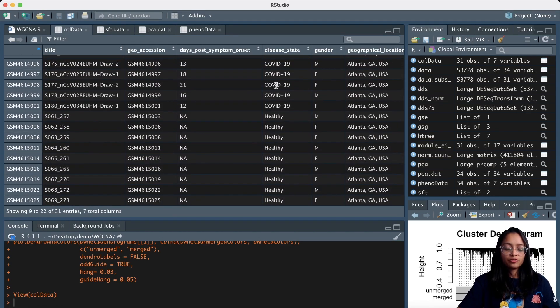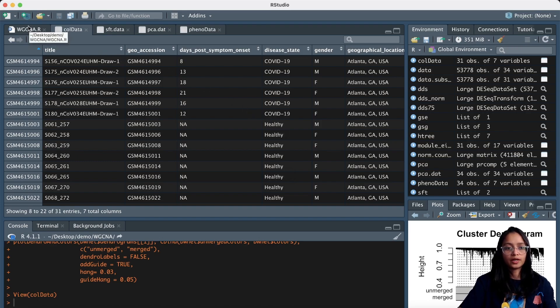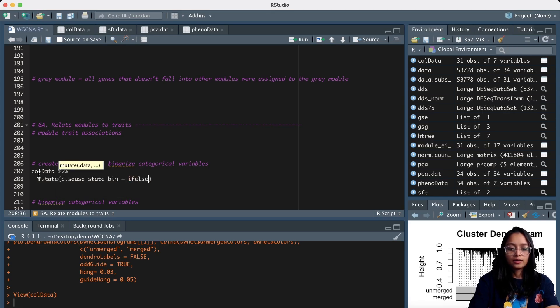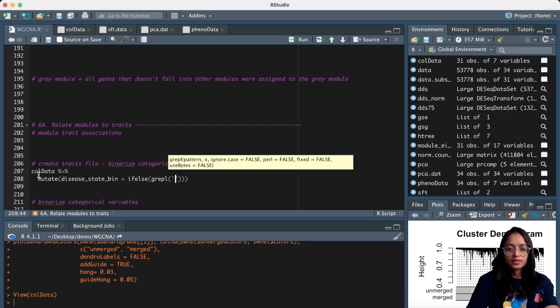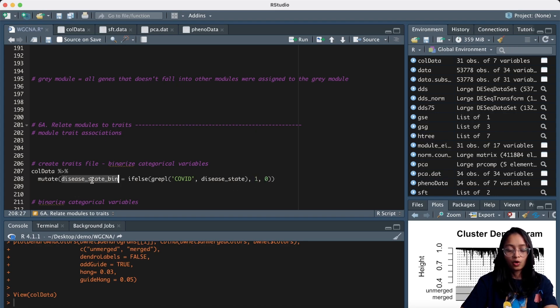In order to find modules that have significant association with disease state, we need to convert this disease state into a numerical variable — or rather binarize this categorical variable. We can start with the call data and create another column called disease_state_binary: if the sample is annotated as COVID-19, give it a value of one; otherwise give it a value of zero. So all patients infected with COVID-19 will have a value of one, and the rest will have a value of zero.